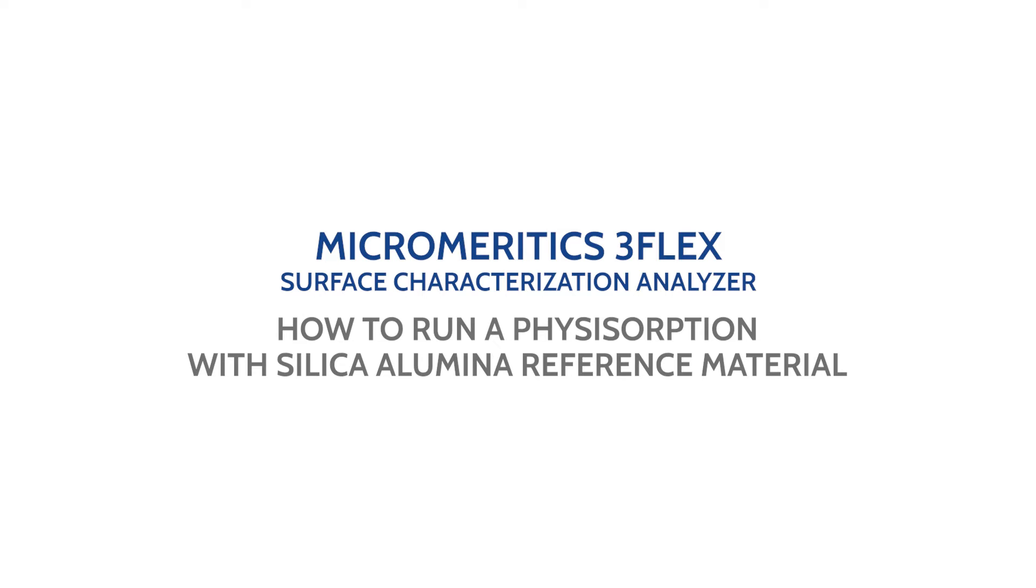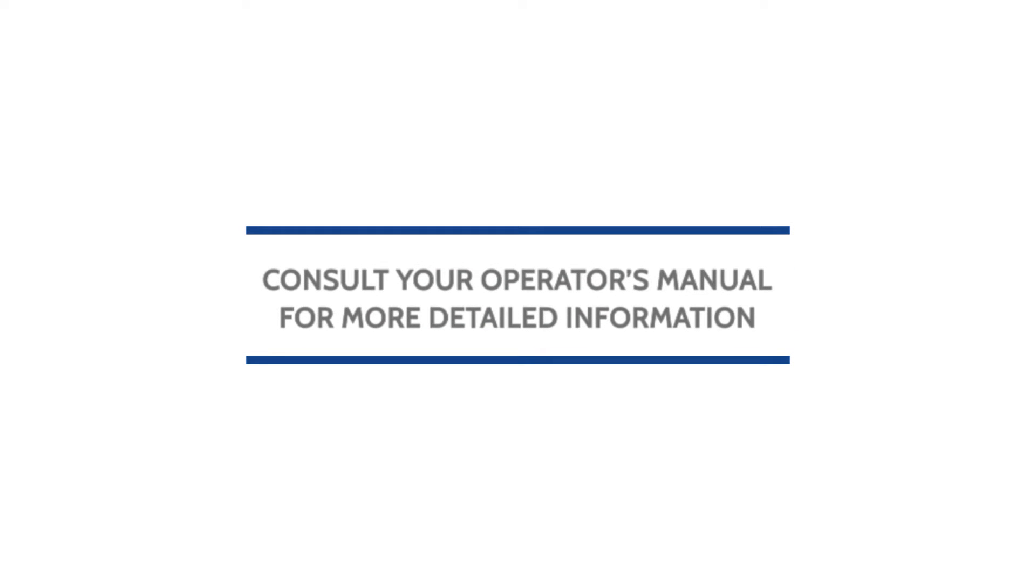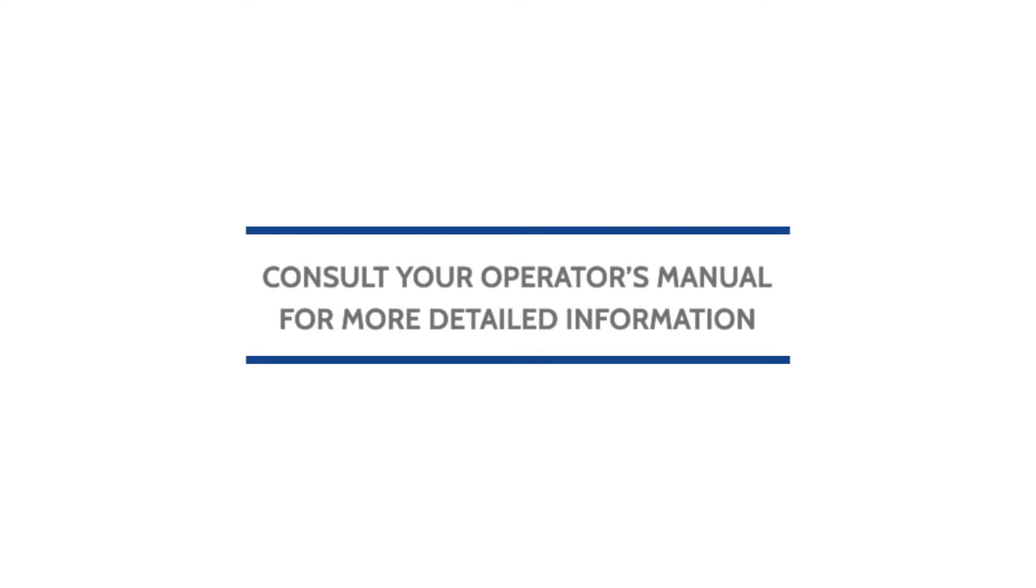This video will show you how to run a physisorption analysis with the silica alumina reference material on the Micromeritics 3-Flex surface characterization analyzer. Remember to always consult your operator's manual for more detailed information.